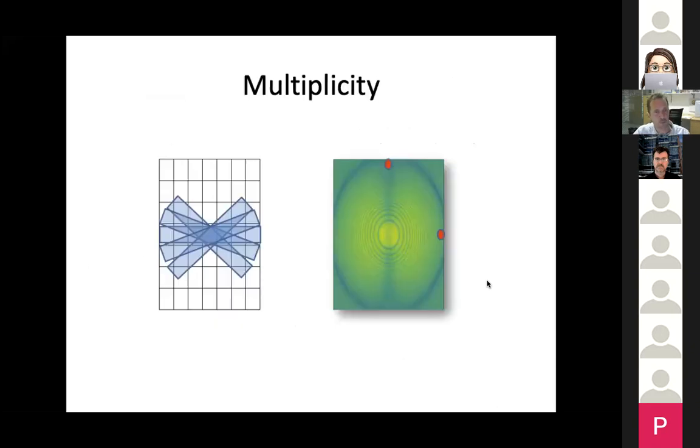Now, if you want to do that, then because parts of the tilt series images in the Fourier transform will of course overlap, and that's most noticeable along the tilt axis, but also at low resolution around that line, there will be a certain amount of overlap.